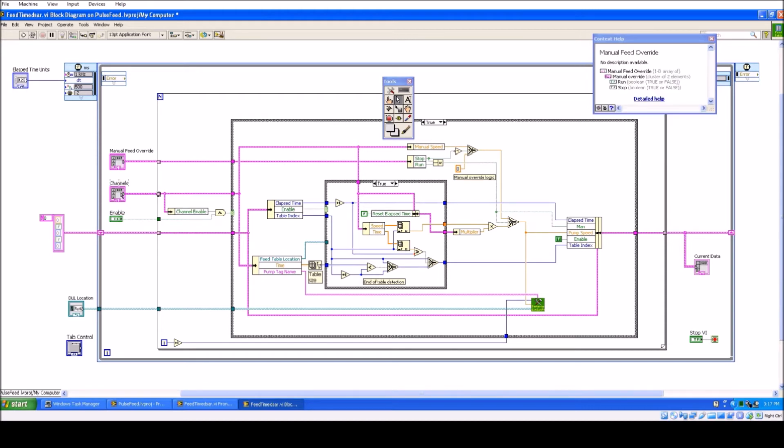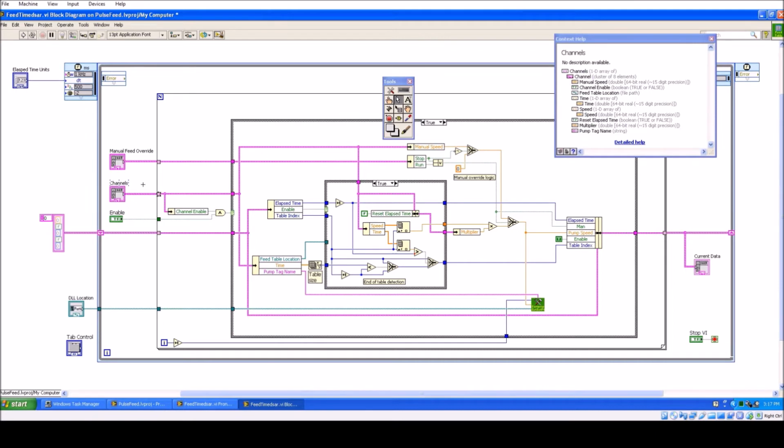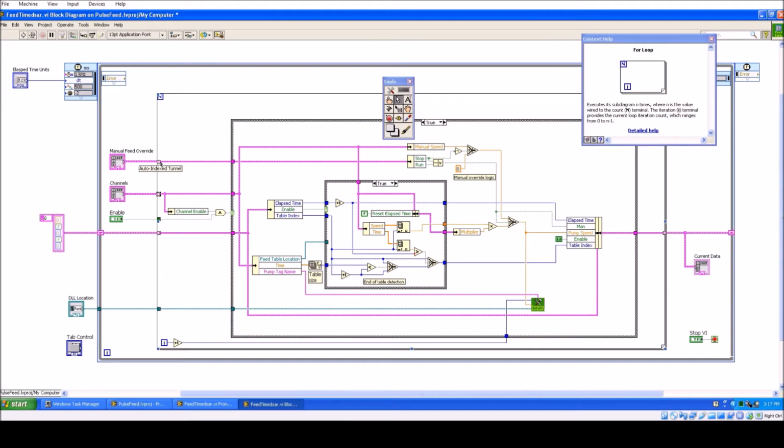Now, what we have here is 2 arrays that are made up of 4 elements, so there's no confusion for LabVIEW as far as how many times to execute. If these were different size arrays, then one would have to add something explicitly to the iteration count to ensure that it would not be ambiguous.